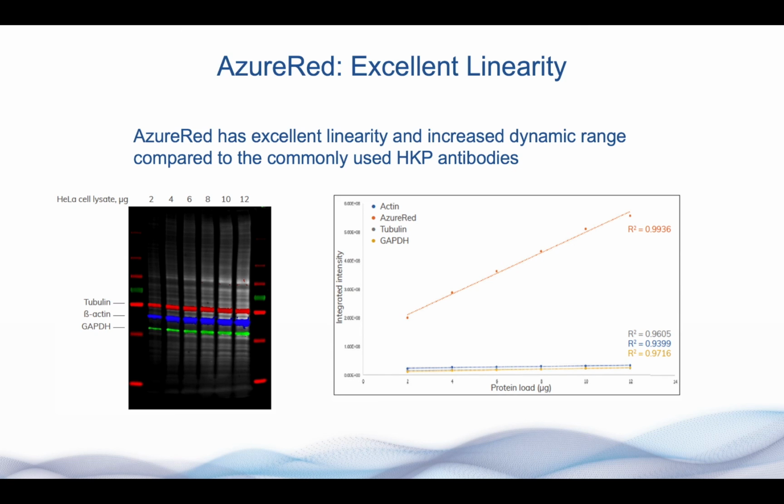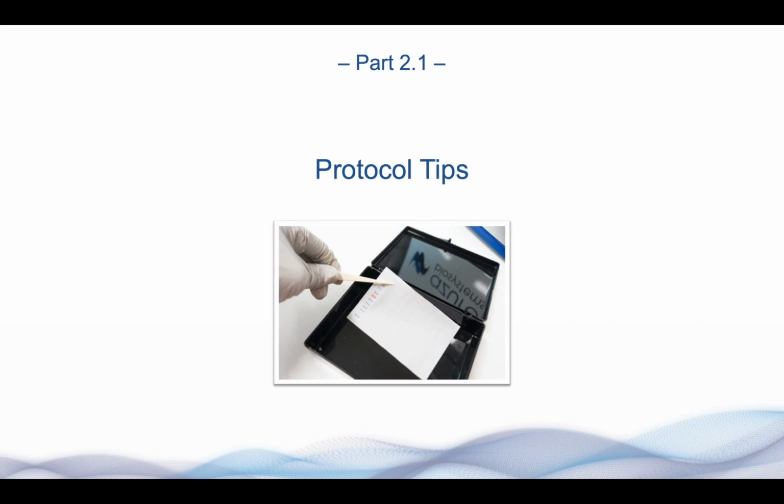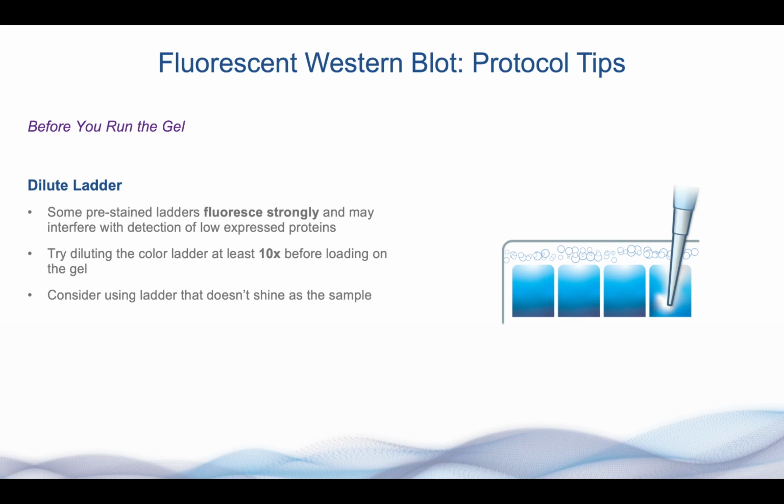But there is more about normalization, and my colleagues will be talking about that later. So let's focus on the fluorescent Western blotting itself. There are certain protocol tips that can help you make your fluorescent Western blot a success from the first try.